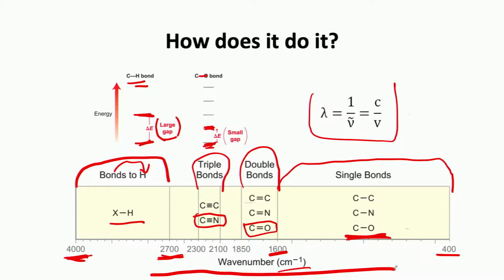You should recall that from Gen Chem 2 when you were using those Spectronic 20s. Was that in Gen Chem 2 or Gen Chem 1? It was probably in both, where you used the Spectronic 20s to do rudimentary spectroscopy. You were trying to discover the concentration of something using absorbance and the concentration curve. This is the same thing except opposite, because now instead of detecting the absorbance, you're detecting the transmittance. And if you really dug deep into what you were doing in Gen Chem, you actually had to take the transmittance number from the Spectronic 20 and convert that into the absorbance number.